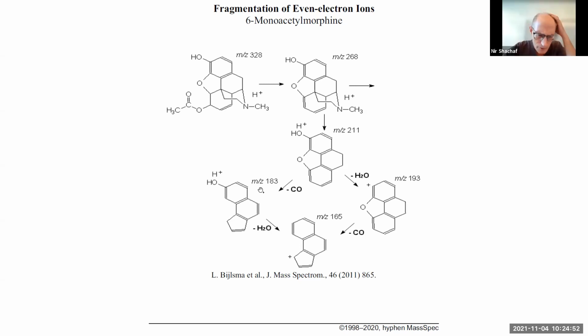I have two corresponding questions. One is that in this case of ambiguity about the sequence of fragmentation or the most possible route, will an ion trap and the fragmentation, MS to the N fragmentation, actually be able to resolve this conflict, this ambiguity?